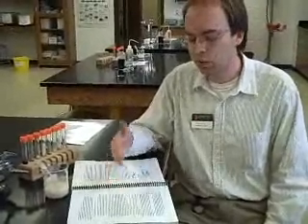Our first experiment was looking at aerobic cellular respiration. I'm not going to go over the entire process of aerobic cellular respiration. You should read your lab manual about that. But basically, in aerobic cellular respiration, the organisms will take glucose, combine it with oxygen, and create carbon dioxide, water, and ATP from that. So we have carbon dioxide gas given off as a waste product of aerobic cellular respiration, and we're going to use that fact to do our experiments today.